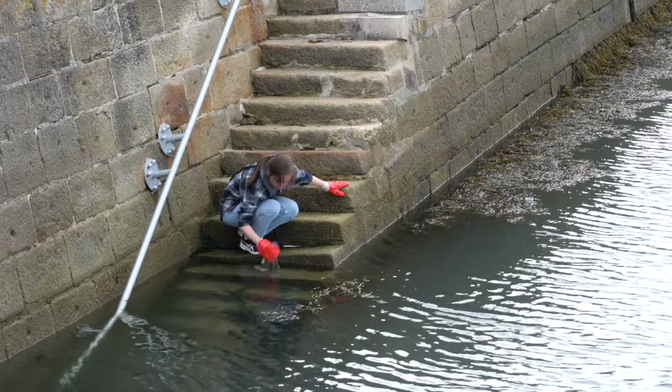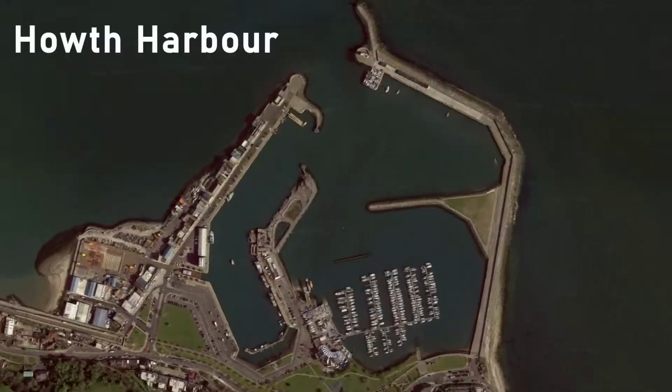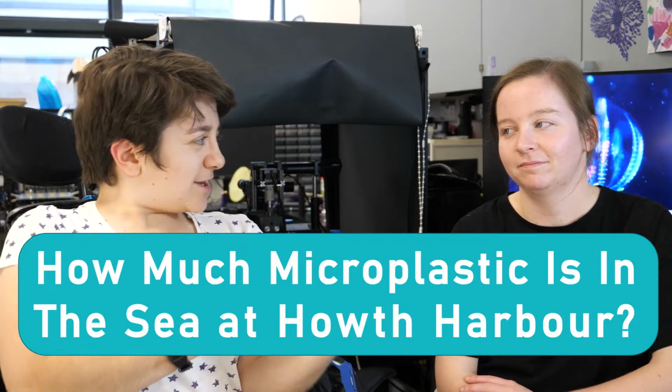Exactly. So I think we should just dive straight in. So just to recap, we went down to Howth for our experiment. We passed 1 litre of seawater through our filter stack and we sampled from 3 different areas in the harbour. So now what we have to do is look at our filters and see what we can find. And if you remember, our specific question is how much microplastic is in the sea at Howth Harbour. So the thing we particularly want to do here is count the number of pieces of microplastic in our sample. Yeah, and I'm really excited to see what we find.